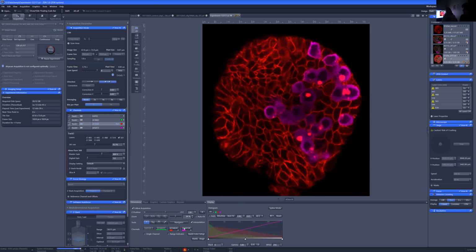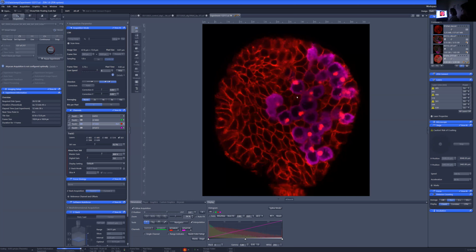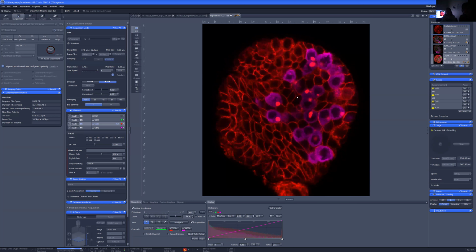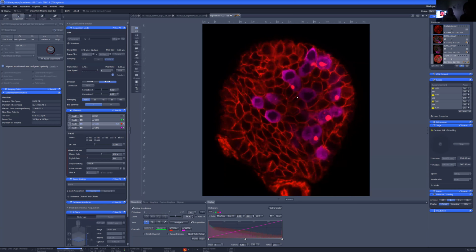Okay, so now the microscope is almost done acquiring this one image, and now it's imaging this pink channel, identifying this Vasa protein that is in the cytoplasm of our egg stem cells. What I've overlaid here is just the red channel and the pink channel, and I think this really nicely highlights these bright dots of red inside the pink cytoplasm.